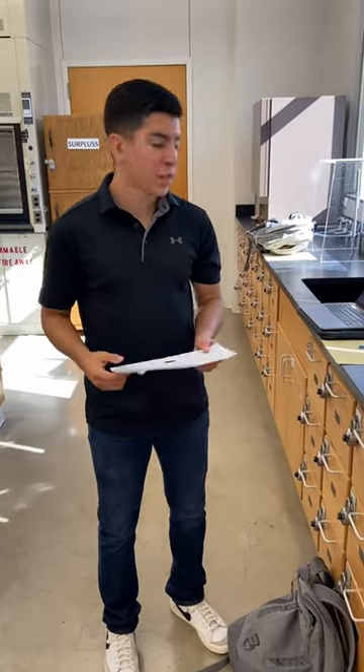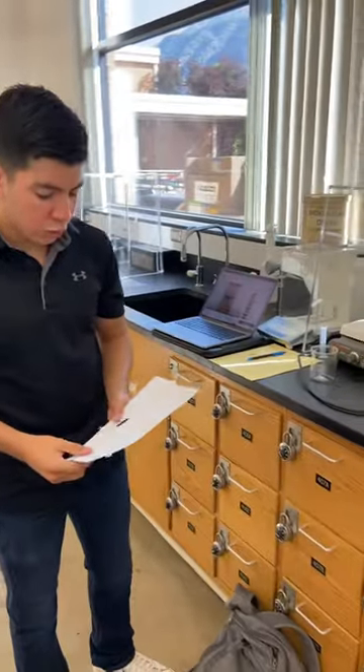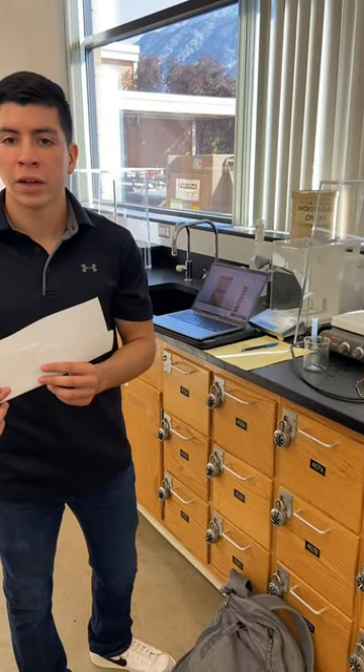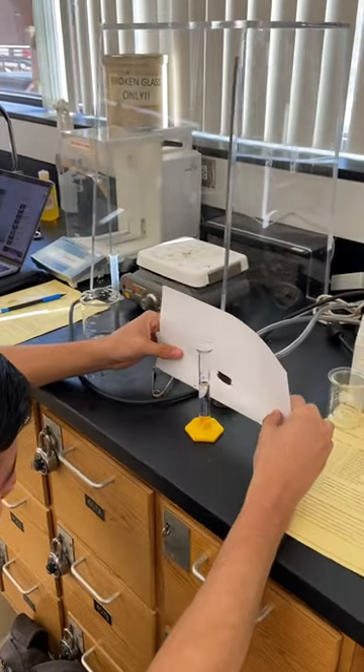I'm Ricardo Romo. I'm in section 1 and we'll be doing the graduated cylinder measuring. So you're going to use a black object to go behind the cylinder. You got to go on eye level and you're going to place it behind your mark.